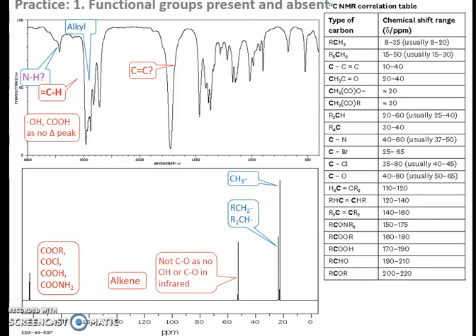So what else have we got? We have that little peak at about 3,400. Could be an NH, but there's nothing really to support the idea of an NH from the NMR spectrum. The mass spec would confirm that for us definitively, but we don't have the mass spec yet. We have that peak at about 205 on the NMR. That could be for an aldehyde or a ketone. Both of those will fall into that range.